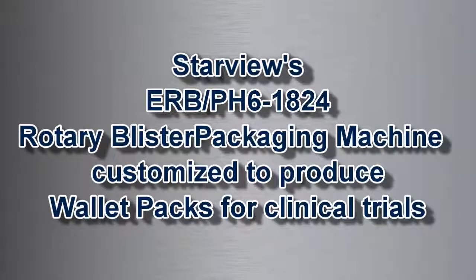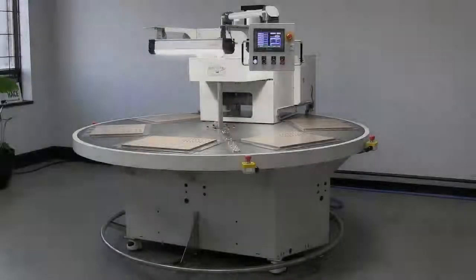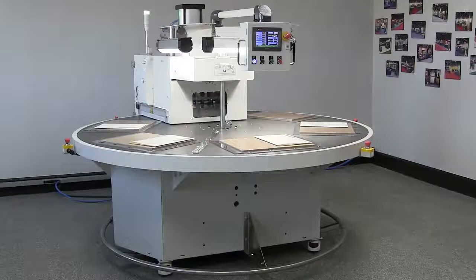The ERB PH6 1824 Rotary Medical Device and Pharmaceutical Packaging Machine has been modified to be used to produce low to medium volumes of wallet pack clinical trial packages.